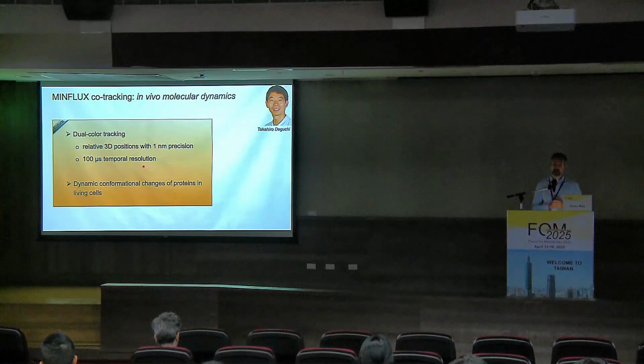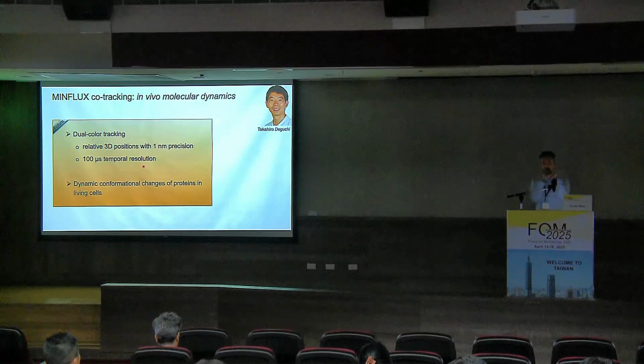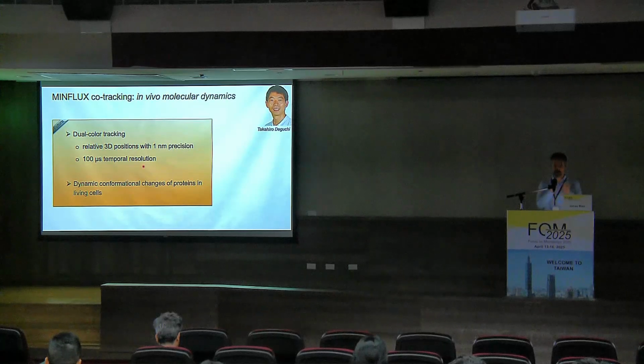However, there's a strong limitation, and that is that we cannot distinguish external motion from internal conformational changes. So this works quite well for something with very regular movement, as we showed for the kinesin, where we know the stepping happens along a line. Or it's something completely random, let's say free diffusion, where we don't care about internal motions. But for all other conformational changes, we would need an internal reference.